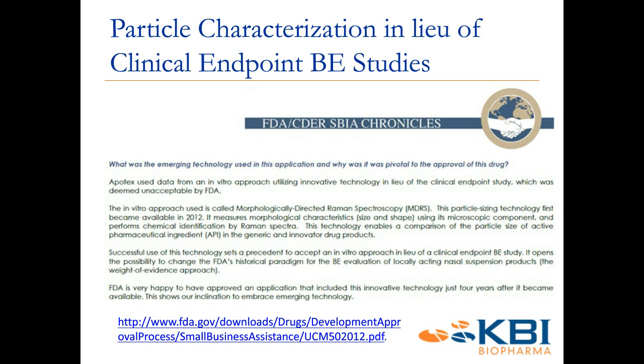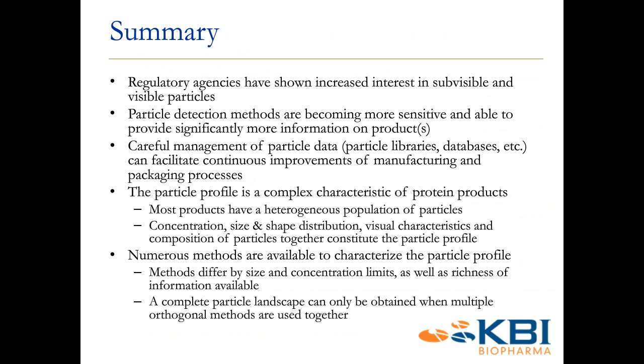So for one of the first nasal biosimilars hitting the market in the U.S., the FDA did a lot of research into this technique and found that it was sufficient to use for characterization of this biosimilar, or generic, if you will, for small molecule talk. And there's a link there if you're interested, or I could certainly send you a link as well to read a little more about the FDA's commentary on this technique.